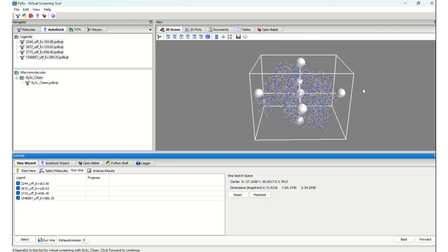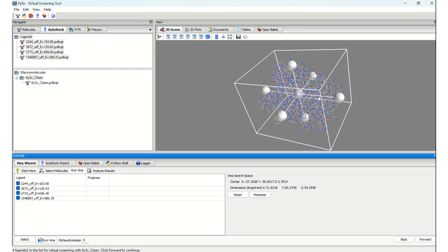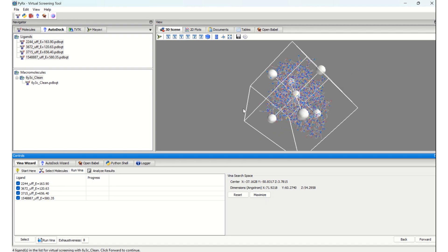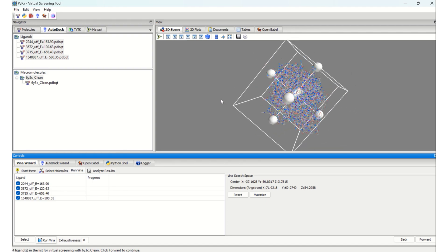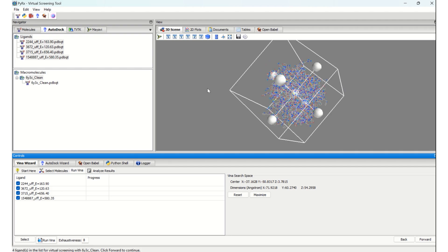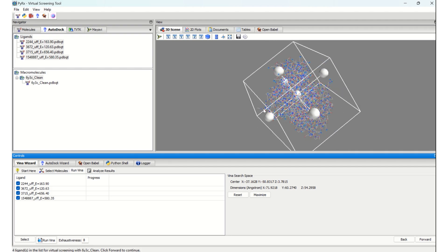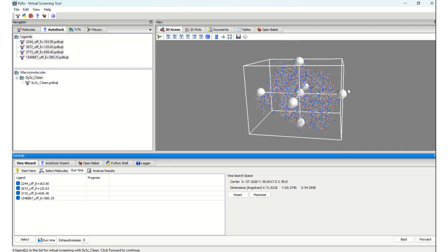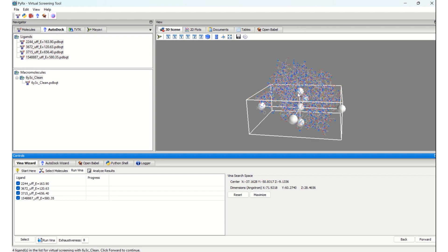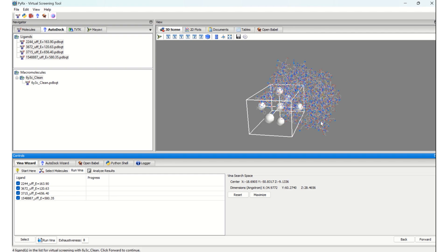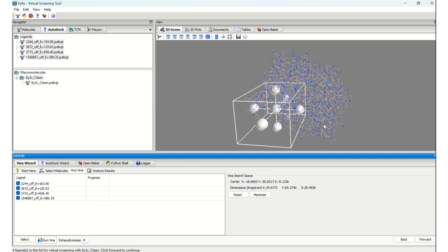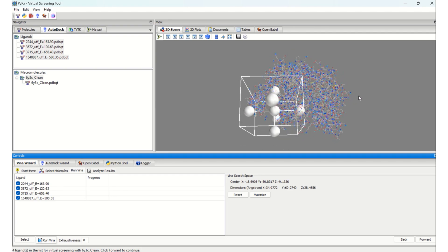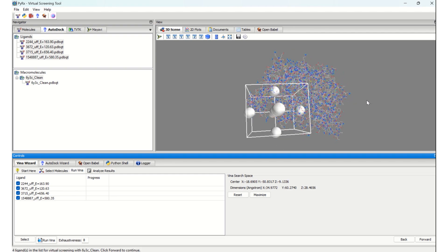For example, like this - if I think that my ligands are going to bind at this particular area, I can go with this particular area. If not, you can select the entire molecule and proceed with blind docking. In order to reduce the burden of my PC and complete this tutorial quickly, I have selected this particular small area.